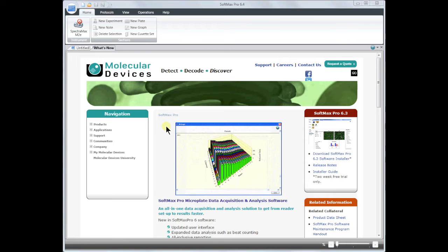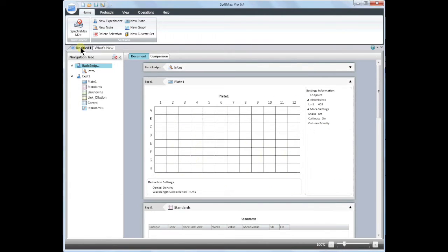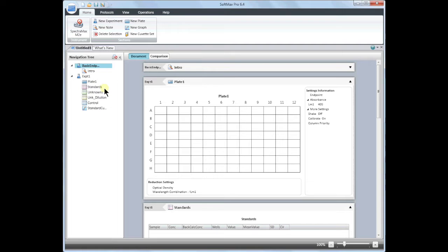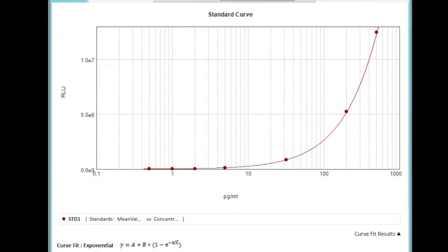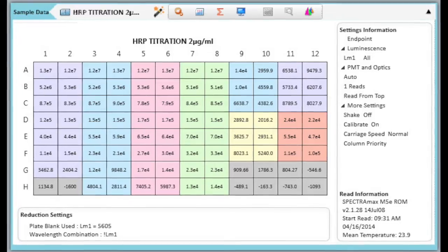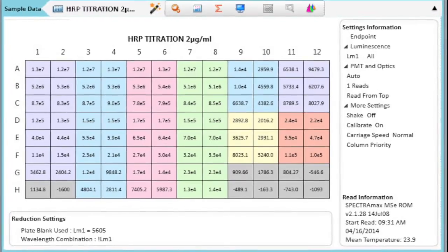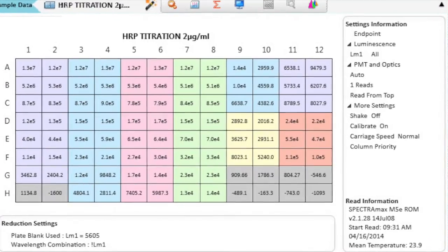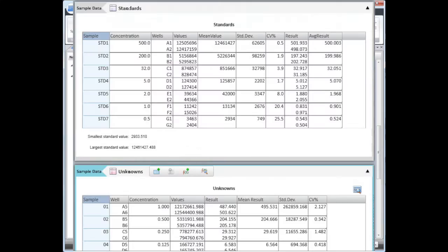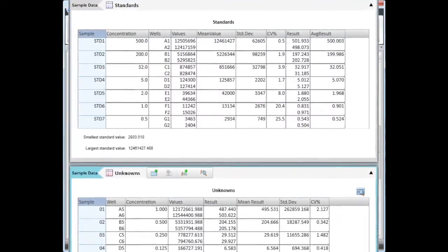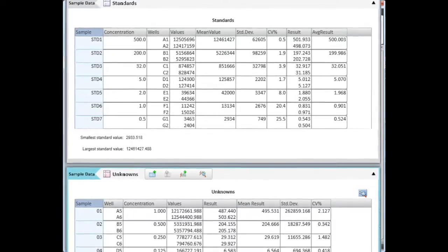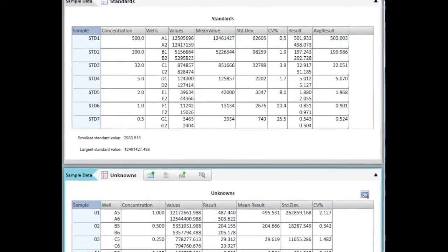After you open SoftMax Pro, click on Untitled 1 to bring up a basic endpoint protocol. The basic endpoint protocol contains preset standard groups and settings that will automatically plot your standard curve, average data replicate sets, and calculate unknown concentrations by interpolating the unknown sample values from the standard curve.